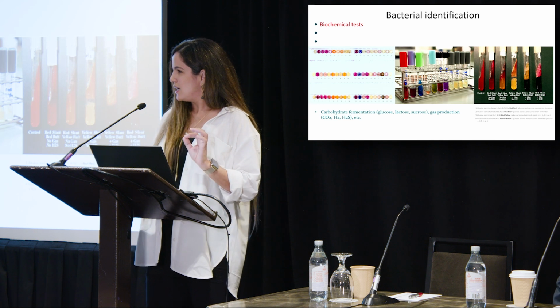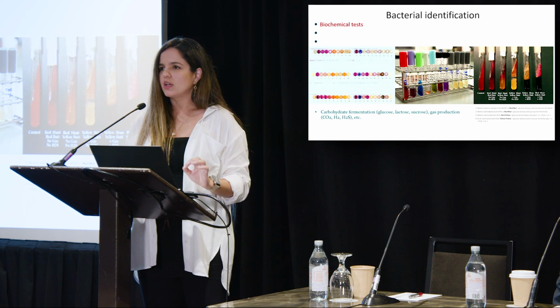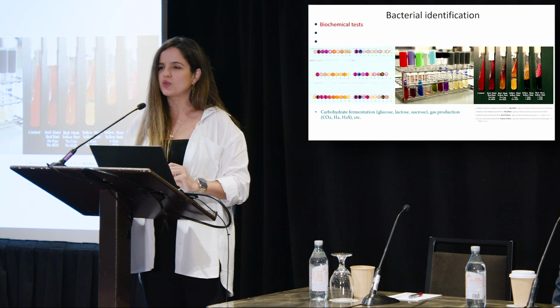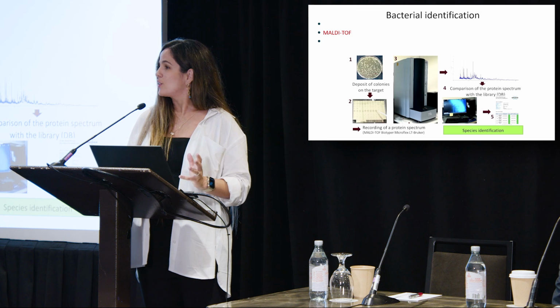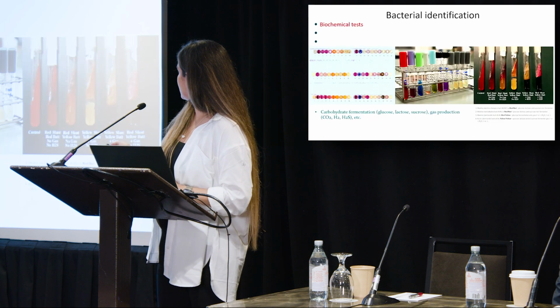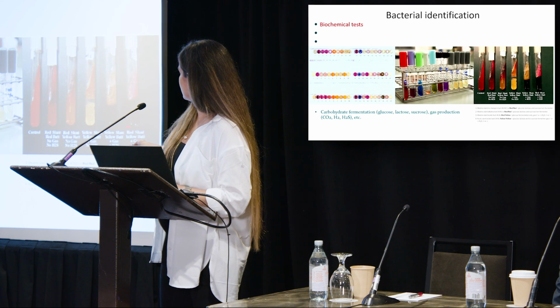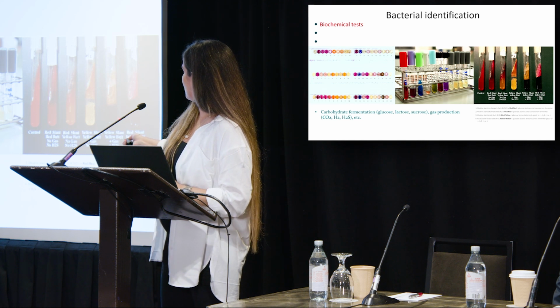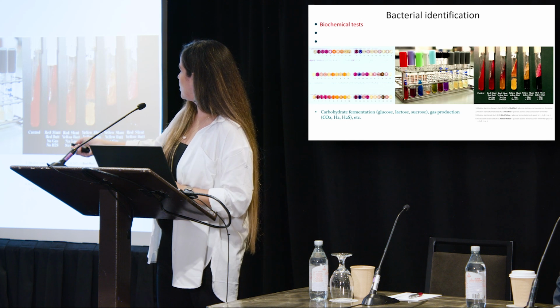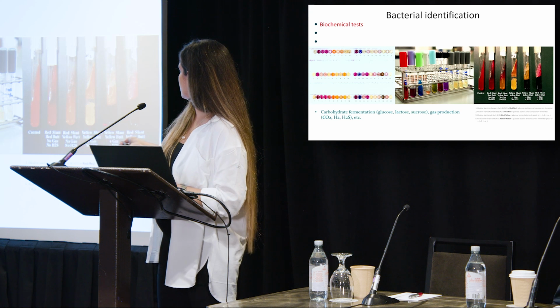Remember that I told you that that black spot in the colony is important? That black spot in the colony means H2S production as well. It's a marker of H2S. Not only that, let me go back. Not only that, even here, this is a black color in the agar, over here as well, and some points depending on the spot that you get in this test.